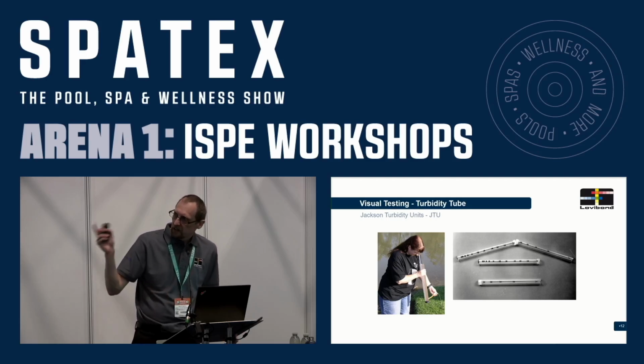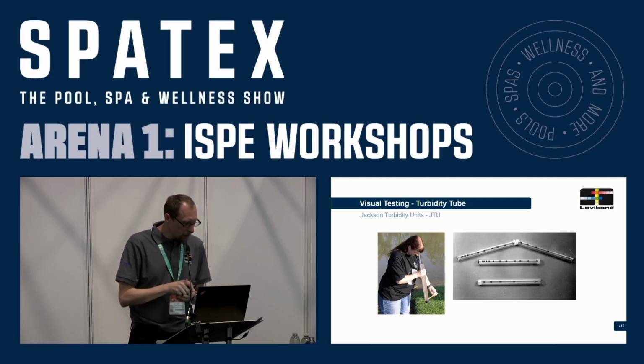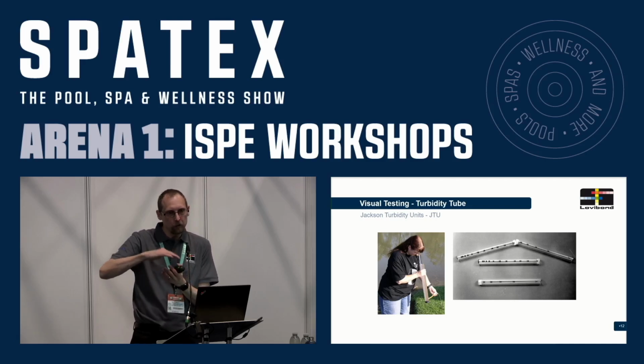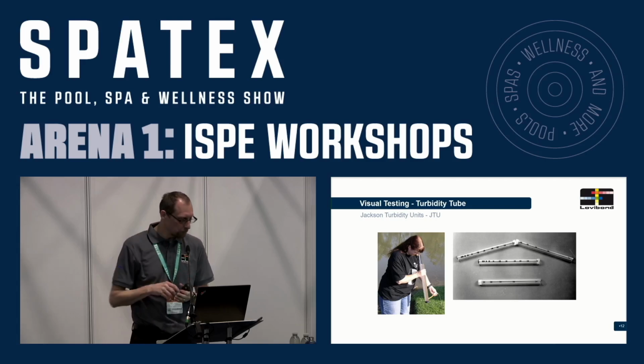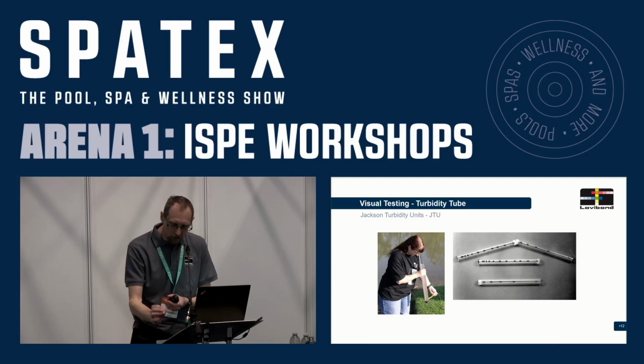Basically the way the turbidity tube works for this application is just like you've seen the lady there. She's filled her sample up right to the top and letting it out through the bottom until there's a little spot on the bottom of the tube. And just as that either disappears or you can see it, you would read the result off the side of the tube. Or there's another version where you would start with the empty tube, fill it up, and again wait for the spot or the cross on the bottom of the tube to disappear, and then you'd take your reading.